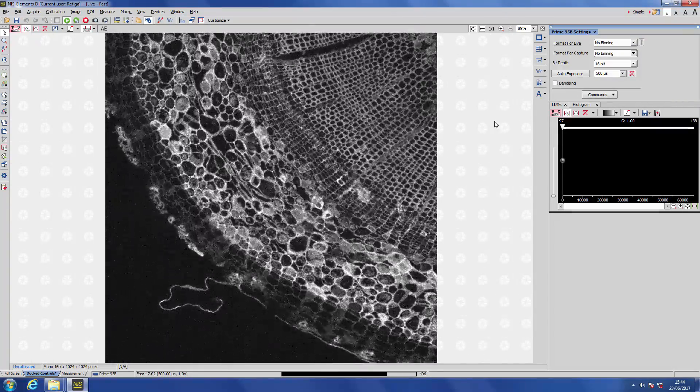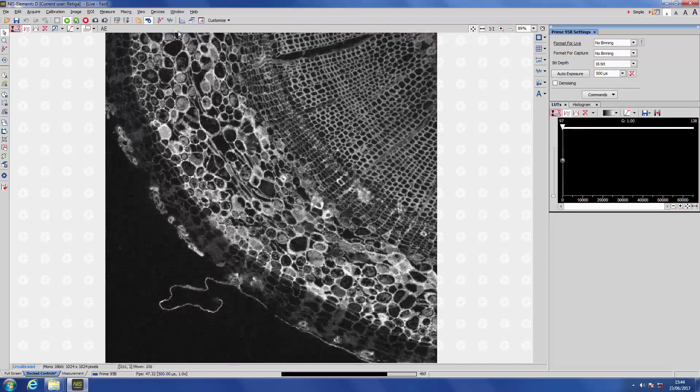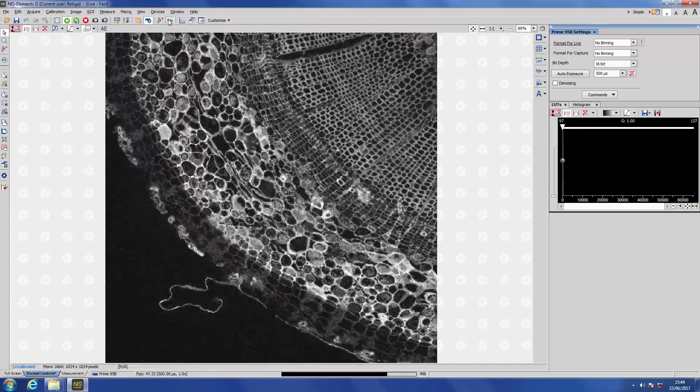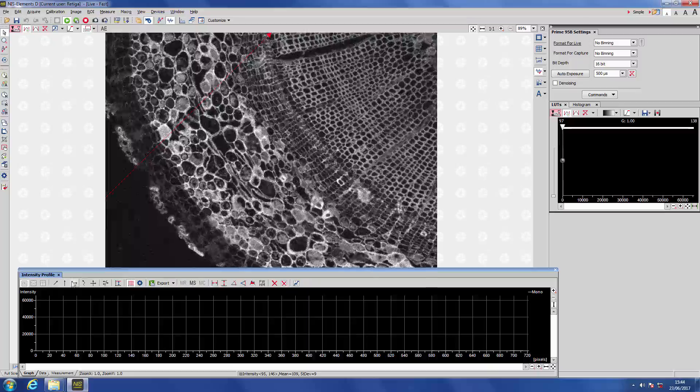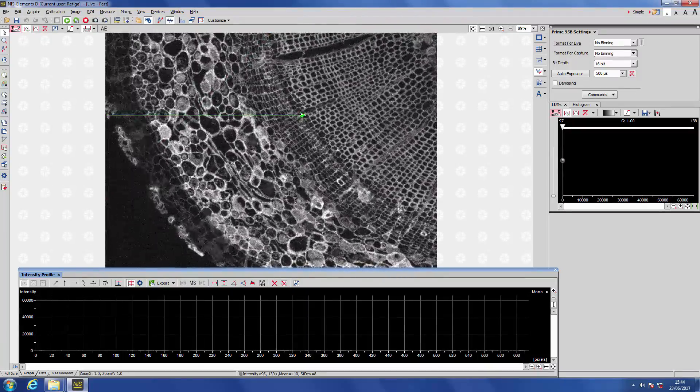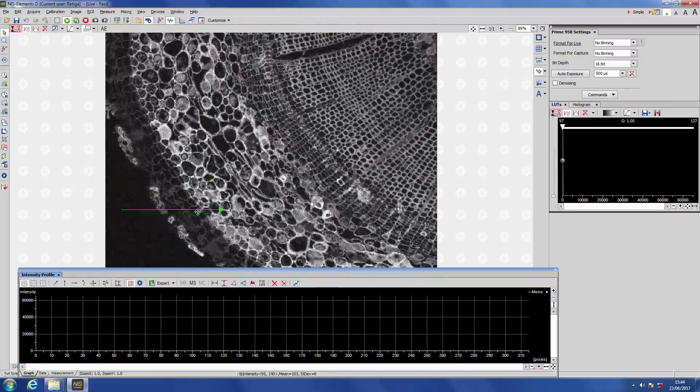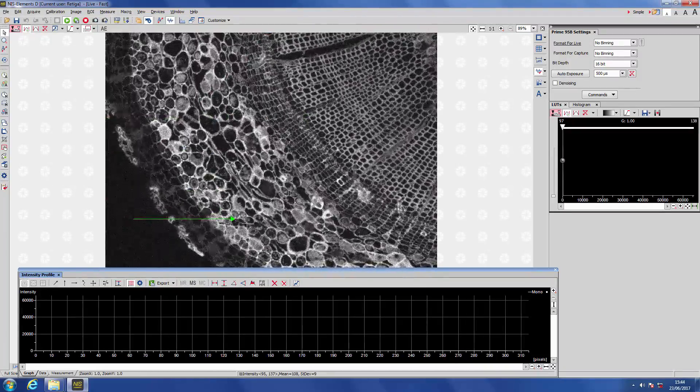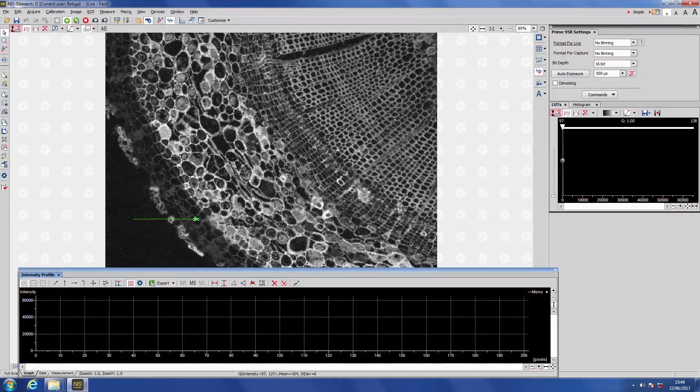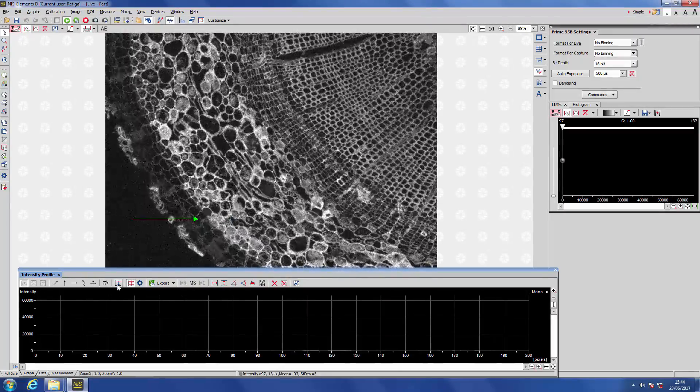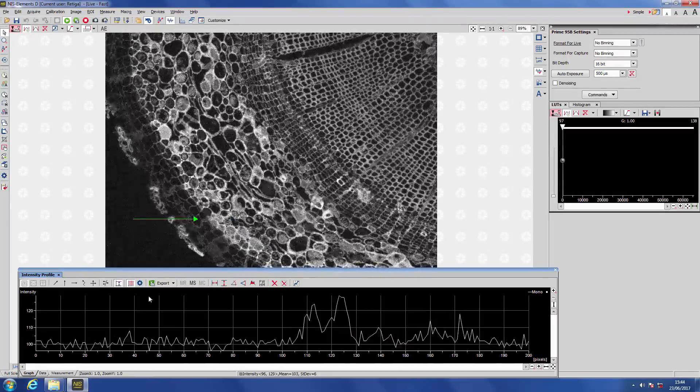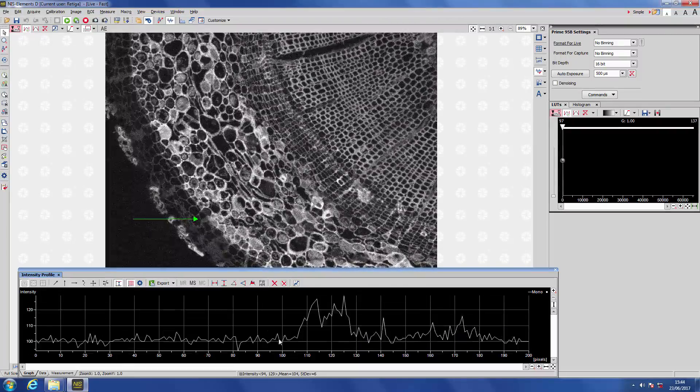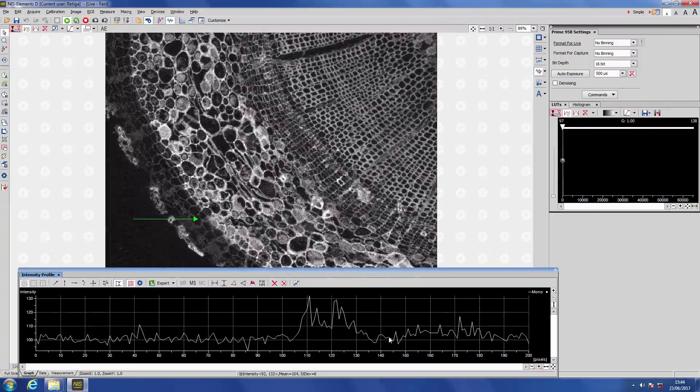One very important thing to note about the Prime Enhanced algorithm is that it conserves all of your signal strengths, your signal values, so you can still run analysis on the data. If you wanted to see a line profile or measure a signal strength, say of this little object here, Prime Enhanced will preserve the values. It's just effectively giving you a longer exposure time, increasing your signal-to-noise.